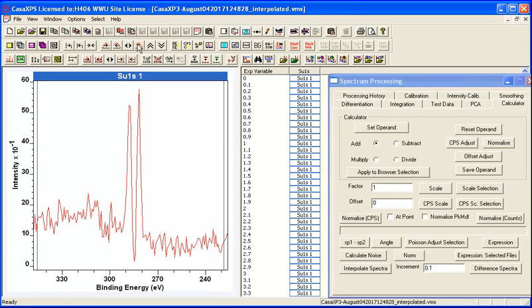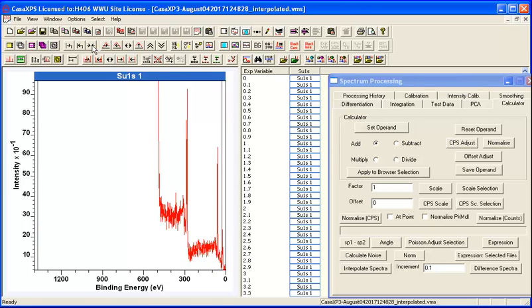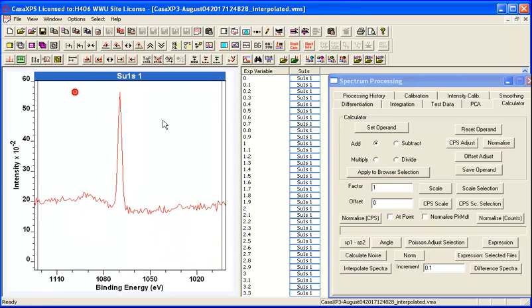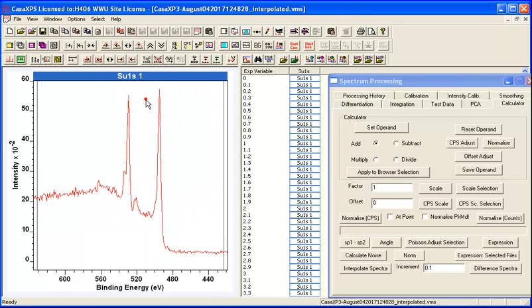So it would appear there are a pair of carbon peaks forming in at least one of these different spectra, and I can see that we've still got sodium, and that looks like a reasonably well formed sodium 1s, and that's the Auger for sodium, oxygen 1s, and this shoulder here is related to this Auger sequence here for the sodium.